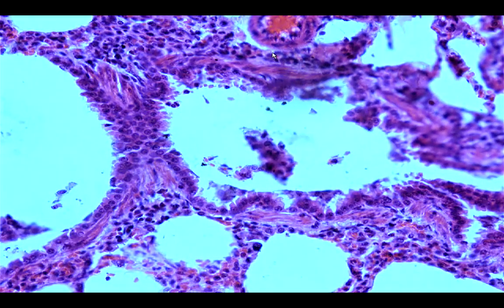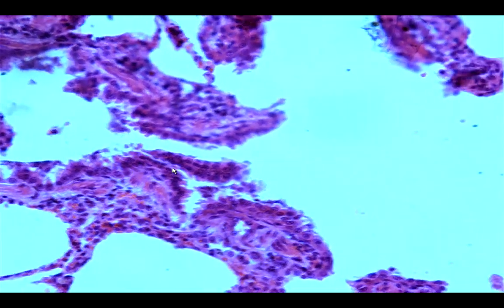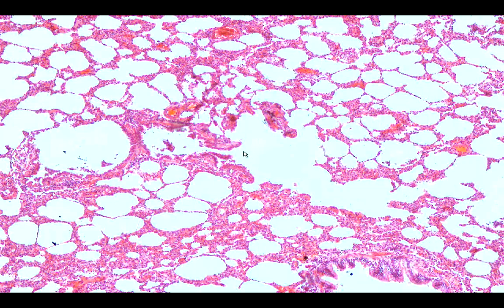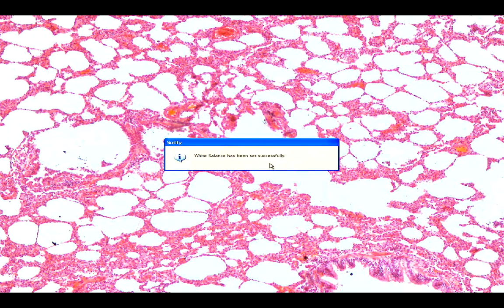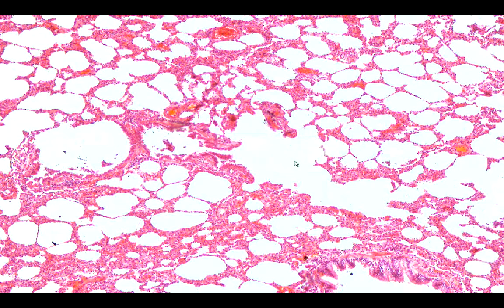Here is an example of a respiratory bronchiole — you can see the presence of cuboidal cells. This is the last portion of the bronchiole, and it opens out into the alveolar duct. From the alveolar duct, going to the alveolar sac, it then opens up into the alveoli.